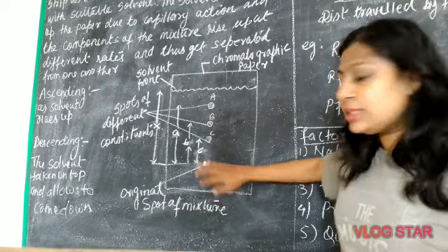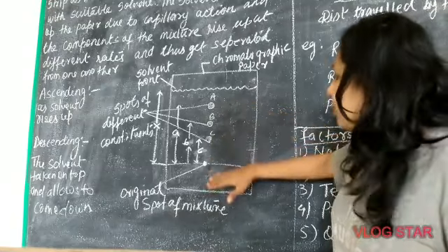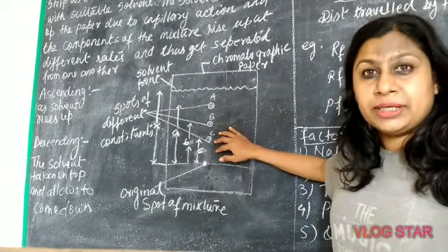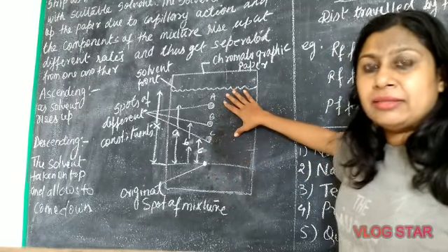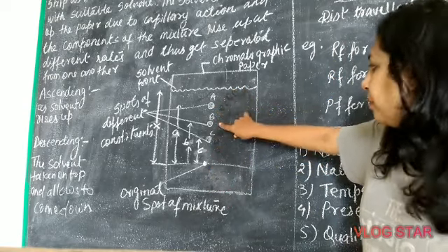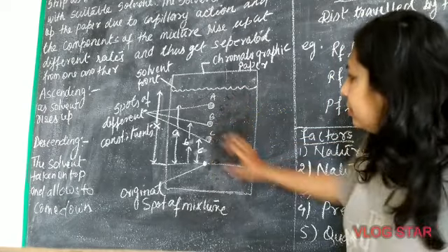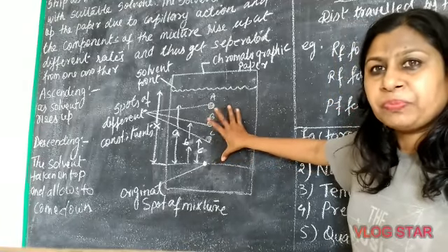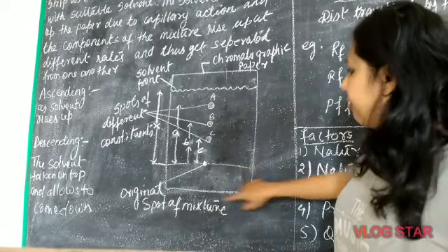Now gradually you will see that as the solvent rises up by capillary action, your components, according to their solubility or movement, also rise up, and that way they get separated. Here you can find the circles A, B and C. Can you see the run of this? C till here, B till here and A till here. This way you will get these spots. So this is the chromatographic paper.